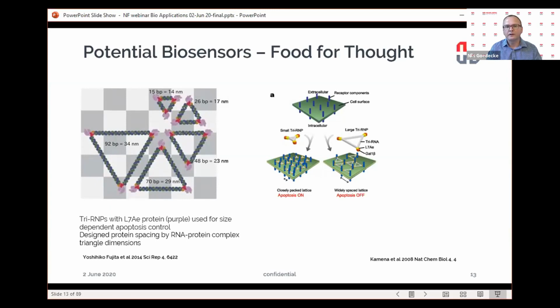And that is quite interesting, because the background here, even though it's a checkerboard, he only used it in his publication to illustrate the size. We could actually make that. I once made a checkerboard like this in microns for a different application for single cell analysis, but here we could do exactly the same thing as he indicated in the illustration of his simulation.